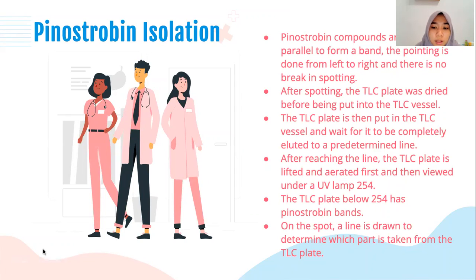On the spot, a line is drawn to determine which part is taken from the TLC plate, and the next part will be presented by my friend.